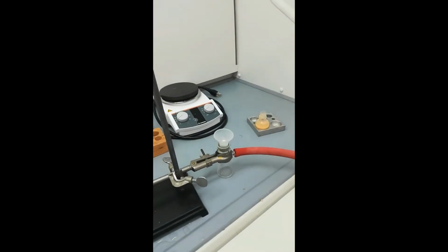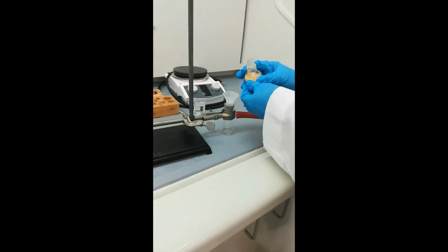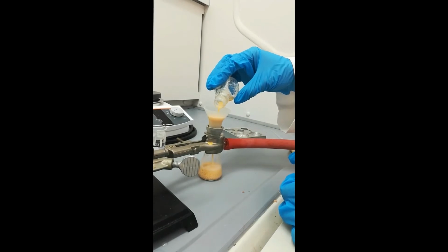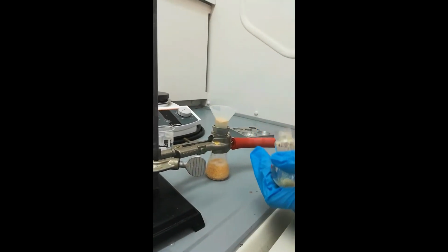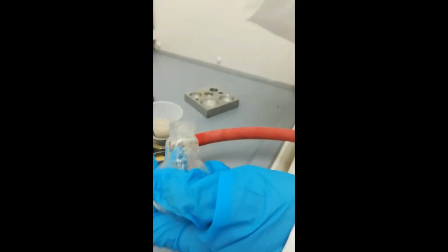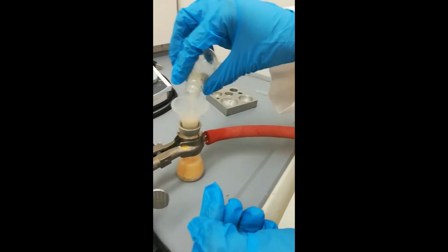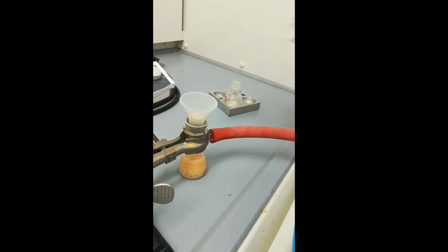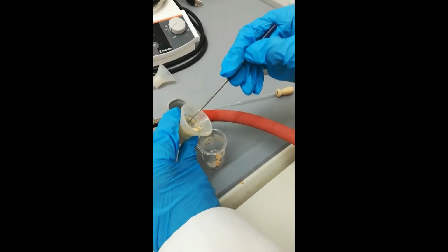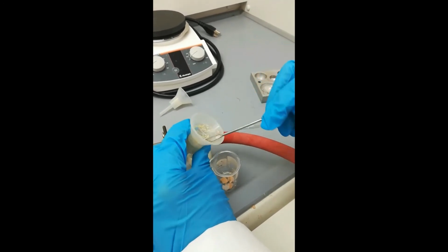Next, we need to vacuum filter the solution. So our TA Goshu is getting the vacuum filtration setup ready. Switch on the vacuum, drain the mixture as we have seen before. Rinse the flask and the product with cold DI water and then transfer the rinse onto the Hirsch funnel. After vacuum drying the product for about 5 minutes or so, we transfer the product into a fresh, clean beaker. This product will now be subjected to recrystallization.